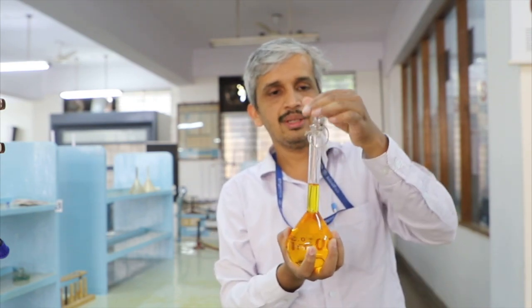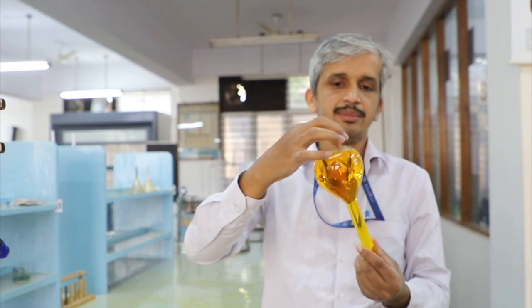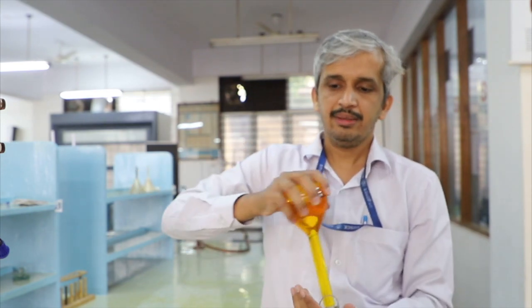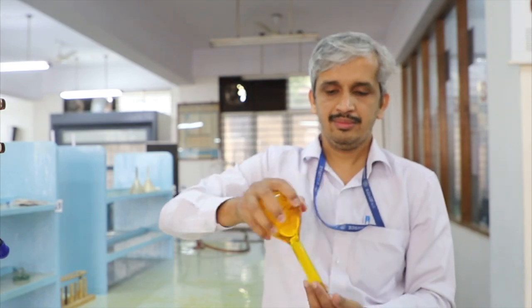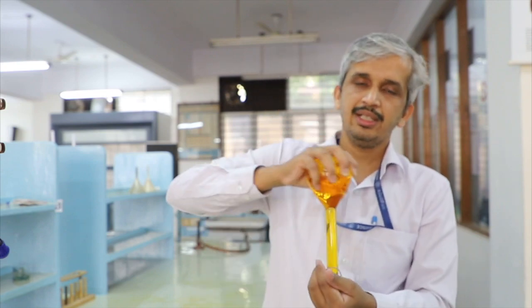How to do it? We have to use this stopper properly and close this properly and invert the standard flask. You get some gap here, so then it should be thoroughly mixed. Then allow the solution to go down, and once again repeat the process.